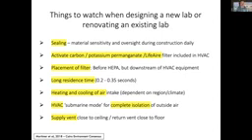And we wanted the longest residence time possible, so the recommendation was between 0.2 and 0.35 seconds. Residence time is how long VOCs are in that HVAC duct system where the filtration takes place. So in a VOC removal system, such as activated carbon and permanganate, you want the residence time to be as long as possible.